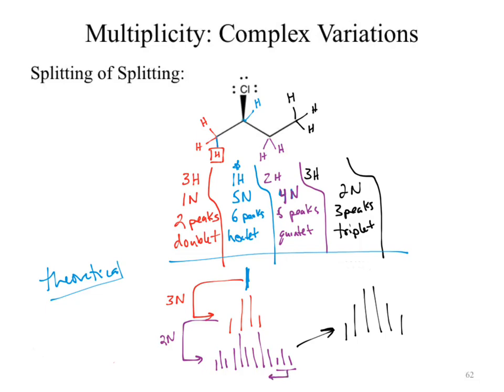This starts to overlap. Those signals happen to overlap in such a perfect fashion that what do we end up seeing? Just 6 total peaks. The theoretical aspect of splitting means we get our final purple line. The actual aspect of what happens when we look at most splitting, that's our black summary that we all predicted to begin with. You are responsible for acknowledging both.